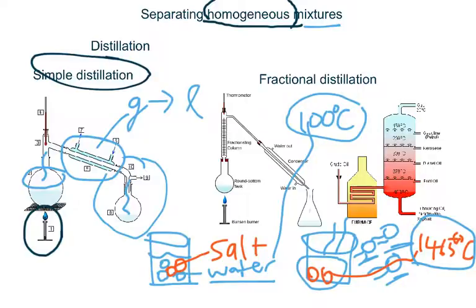Now, this condenser will have water constantly circulating in it, and this water that circulates throughout the layered tube will absorb the heat from the gas, thus turning it from a gas to a liquid. And note that the water will only be touching the outside of the tube, so it won't be going into the white part here. No, it stays outside, and the water just flows back in and out.